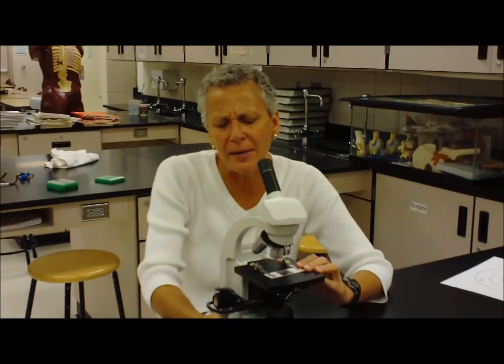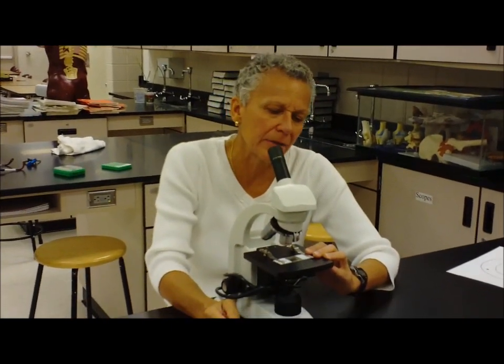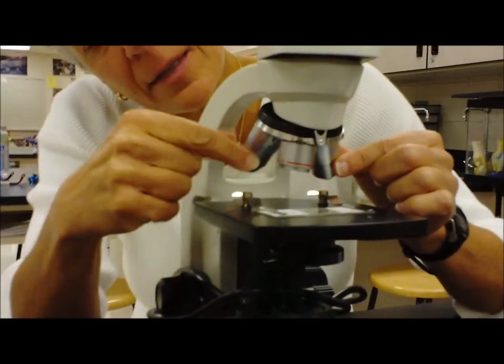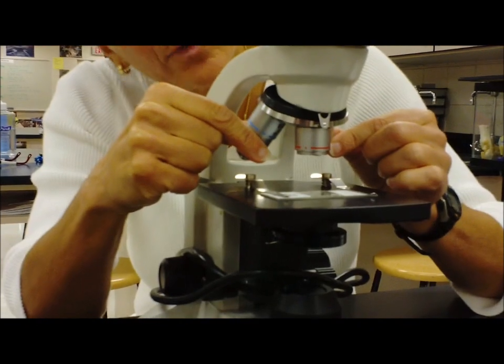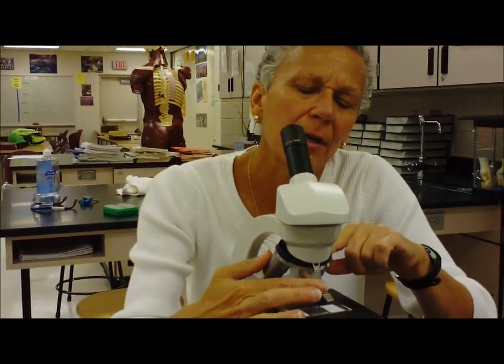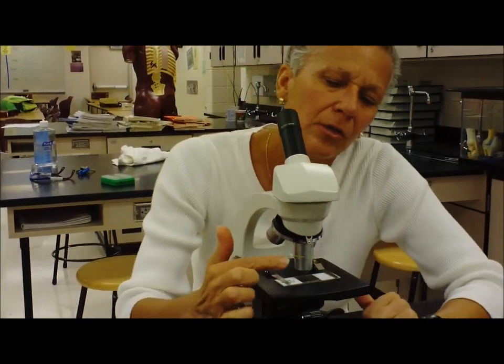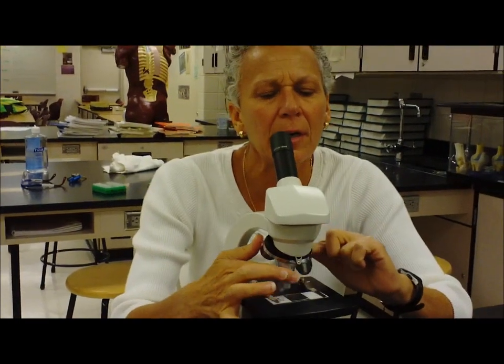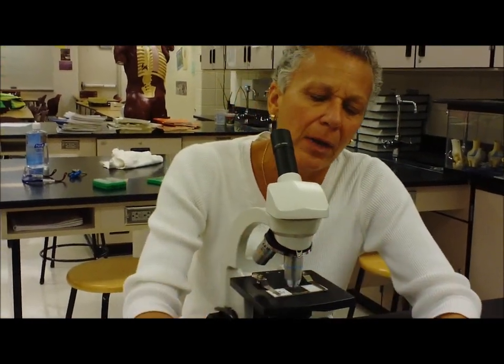First thing I want to do is find my sample under the scanning lens. And let's talk about what the three lenses we have are. The shortest one is the scanning lens, and you know it's in place when you hear kind of a little click. So I'm going to find my object here, turn the revolving nosepiece to look at the low power lens. And then once I've focused it here, then I'm going to switch to the high power lens.